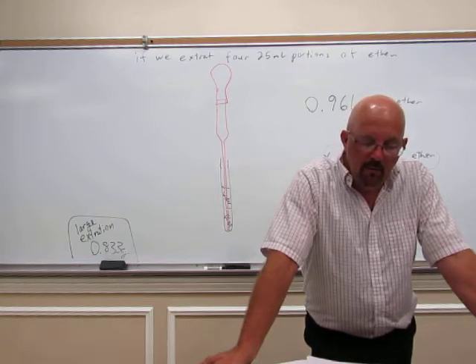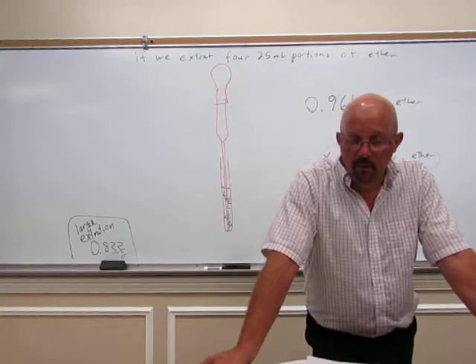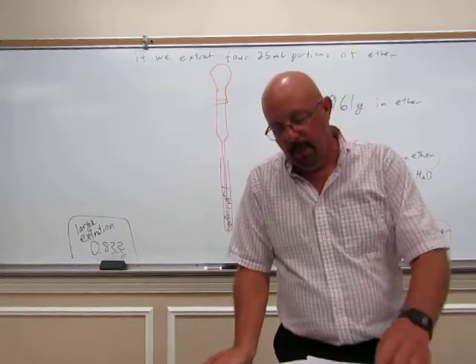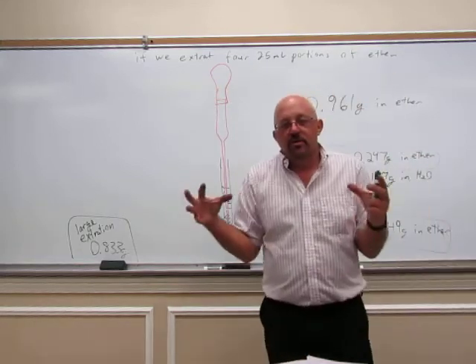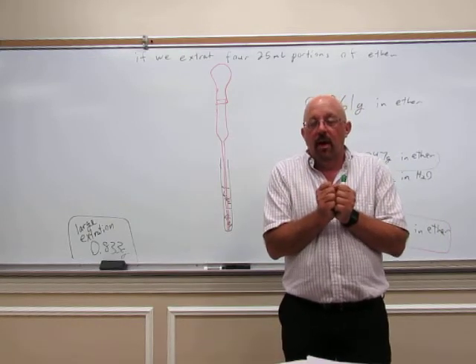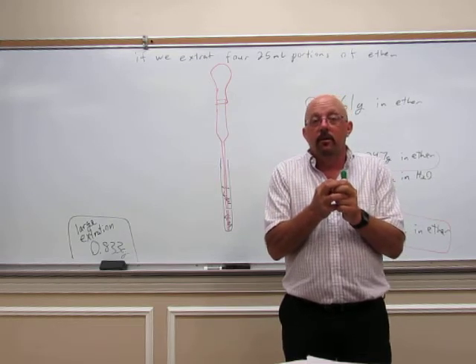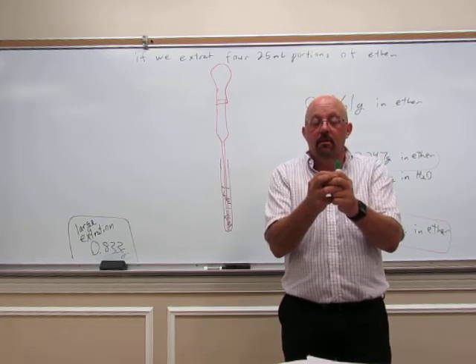Now, how do you know when it's dry? There should be a few of the pellets that will move when you flick the tube. So when you put those in there, it will soak up the water, and those pellets will stick together, and they will not come apart. They grab that water and hang on to it, so they're clumped together.